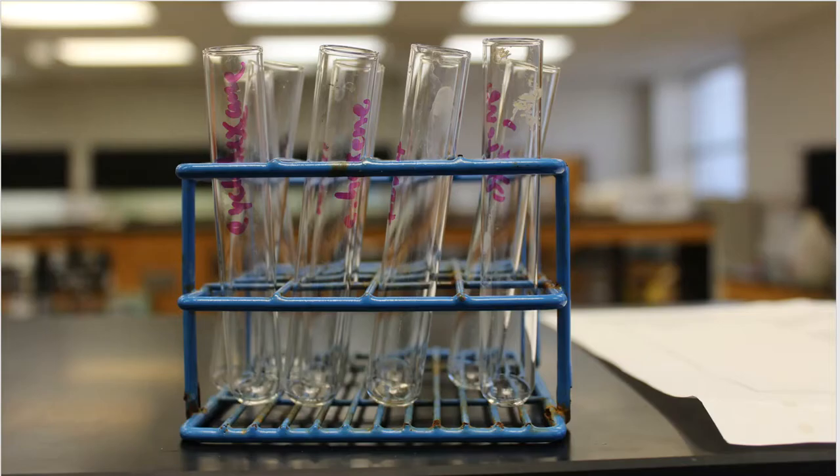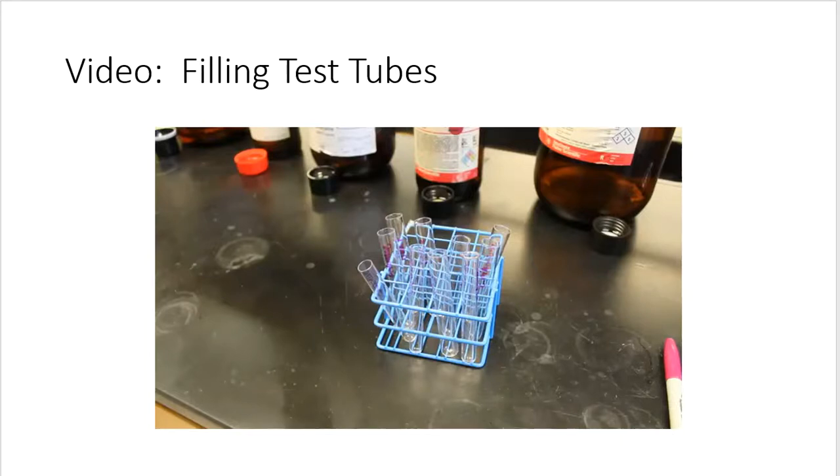All right, so now I need a set of test tubes, and I'm going to have to label them. And that's what I've done here with just a Sharpie marker. I've brought out my test tubes. Here's the test tube rack. I've written on each one of them what's going to go on the inside of them. All right, so let's take a look at what I do here in order to prep this analysis.